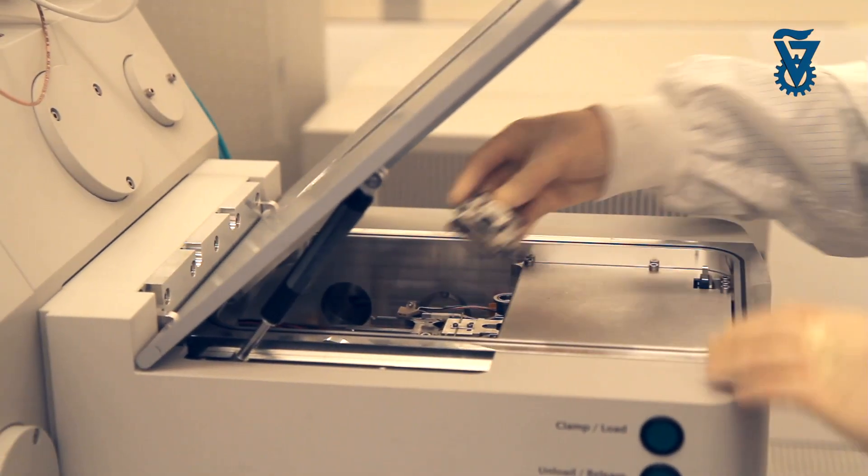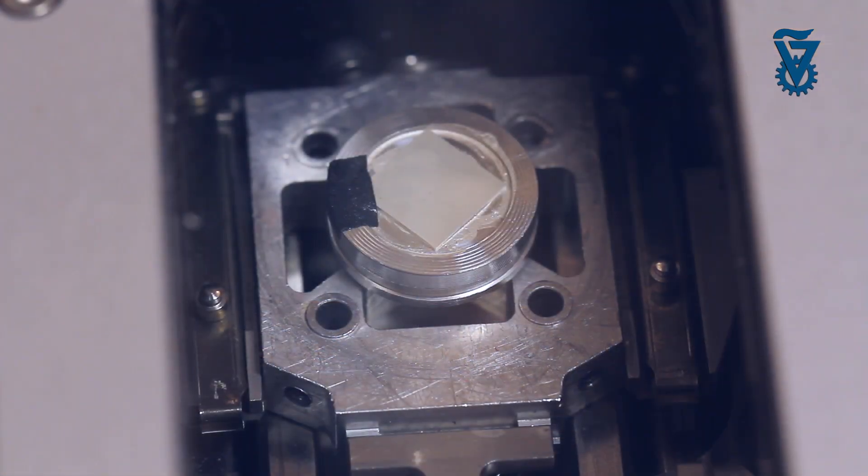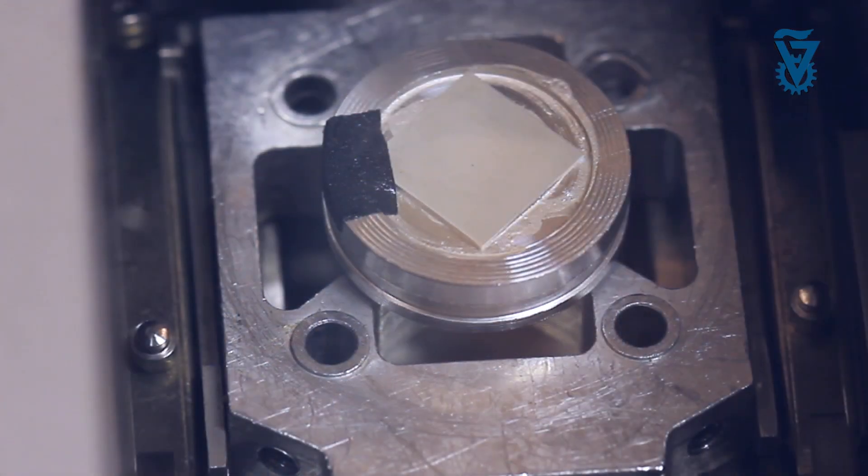When the ion beam impinges on the silicon sample, it's knocking the atoms off. Atoms are coming out, and as the beam sits in one position, the holes get deeper and deeper, and then we move it over a little bit and we continue etching — or writing, if you will — the letters of the Declaration of Independence.